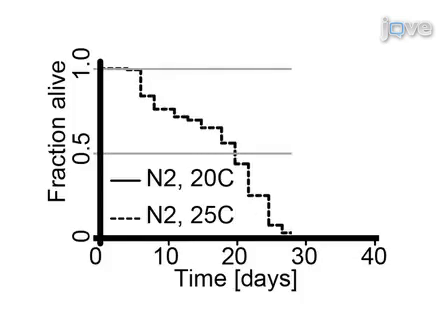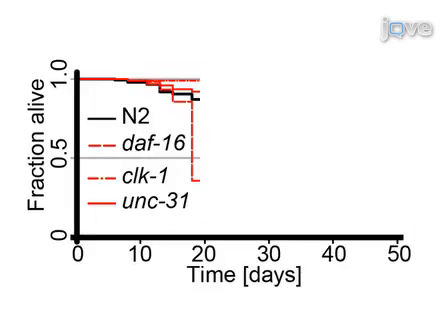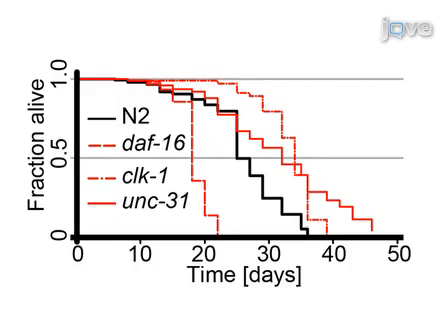This figure shows results of C. elegans lifespan curves recorded at 20°C and 25°C. The microtiter-based lifespan assay accurately reproduces temperature-dependent changes in lifespan. Similarly, as shown here, the microtiter plate assay reproduces changes in lifespan from mutants reported to have lifespans that differ from wild-type N2 animals.